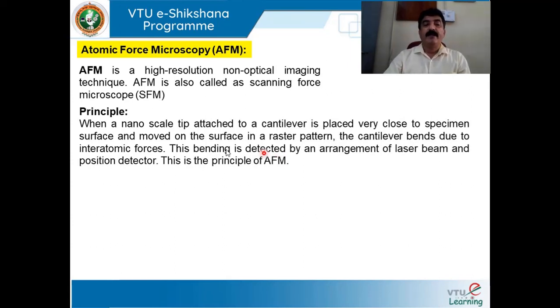Principle: when a nanoscale tip attached to a cantilever is placed very close to the specimen surface and moved on the surface in a raster pattern, that means along X and Y direction, the cantilever bends due to interatomic forces. This bending is detected by an arrangement of a laser beam positioned above the surface and also with the help of a detector. See, I explain.